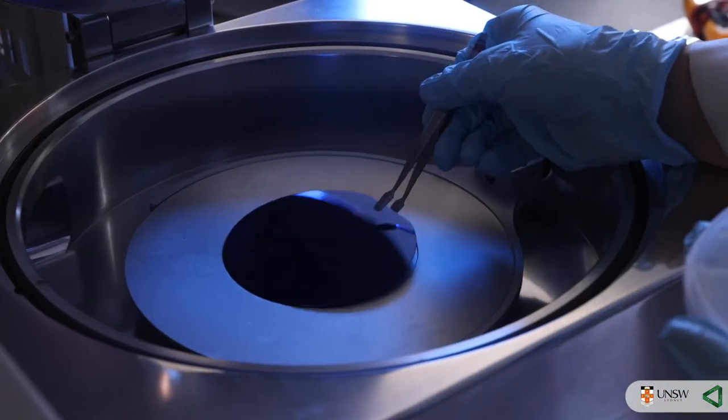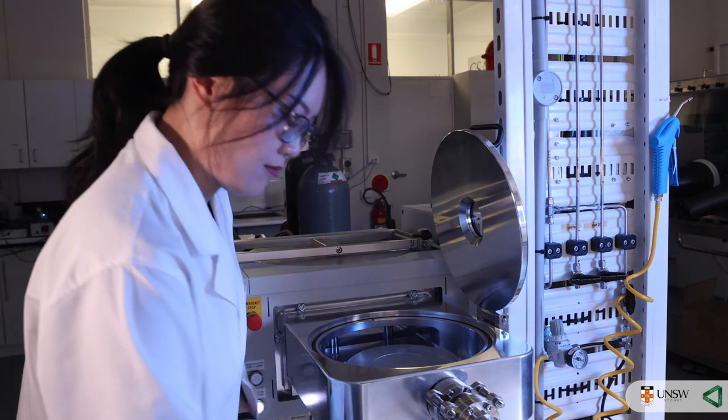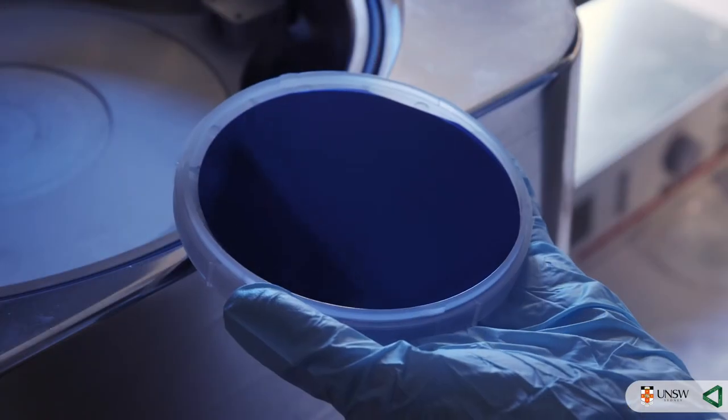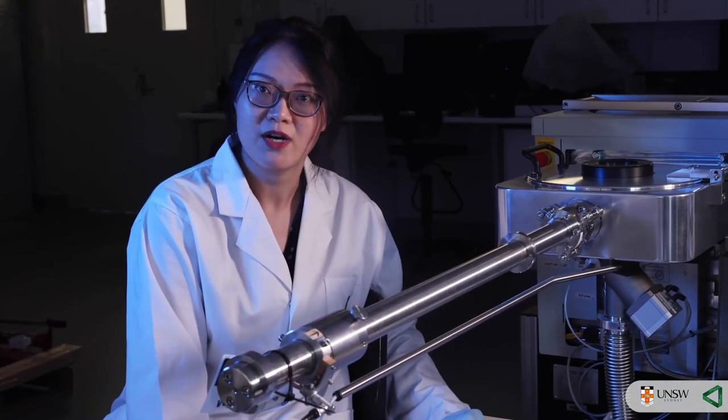The pulse will only take 30 milliseconds and it will wait around 200 milliseconds between different pulses. The process will take roughly around 10 minutes, so this is a very critical piece of machine to our research.